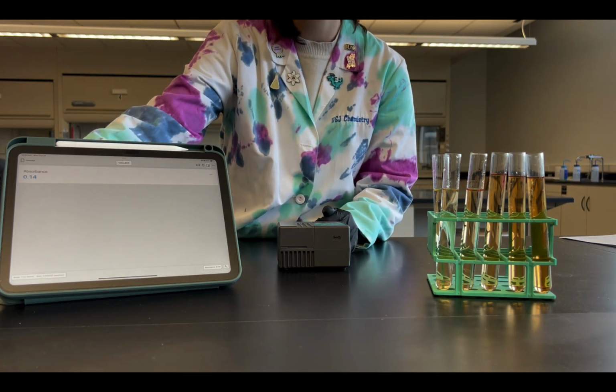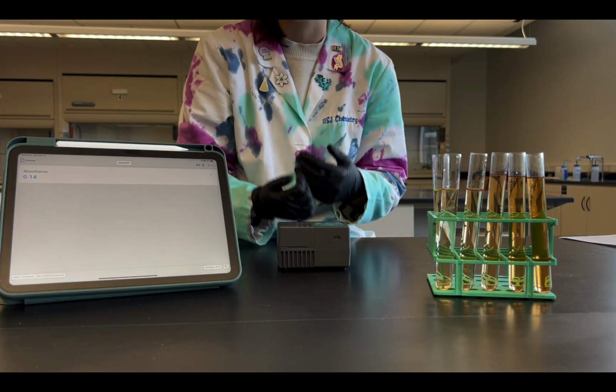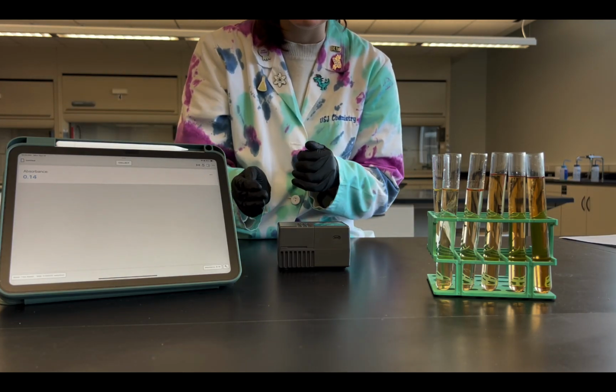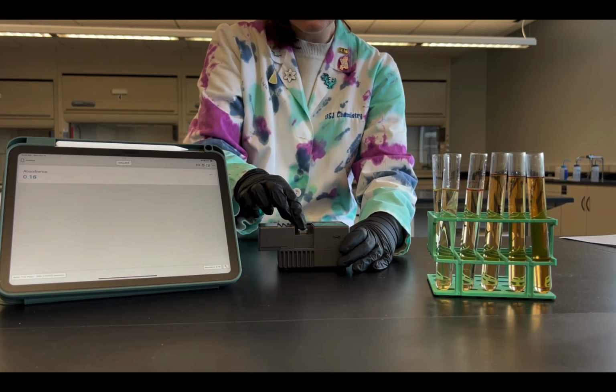Now these are the values that LabFlow is providing to you. That's the provisional data that it was asking about. It essentially gave you these absorbances. So you can see that there was a lot that went along the way to get those numbers, and that's why I wanted to make this portion of the video, to show exactly where they're coming from. So we just continue on.